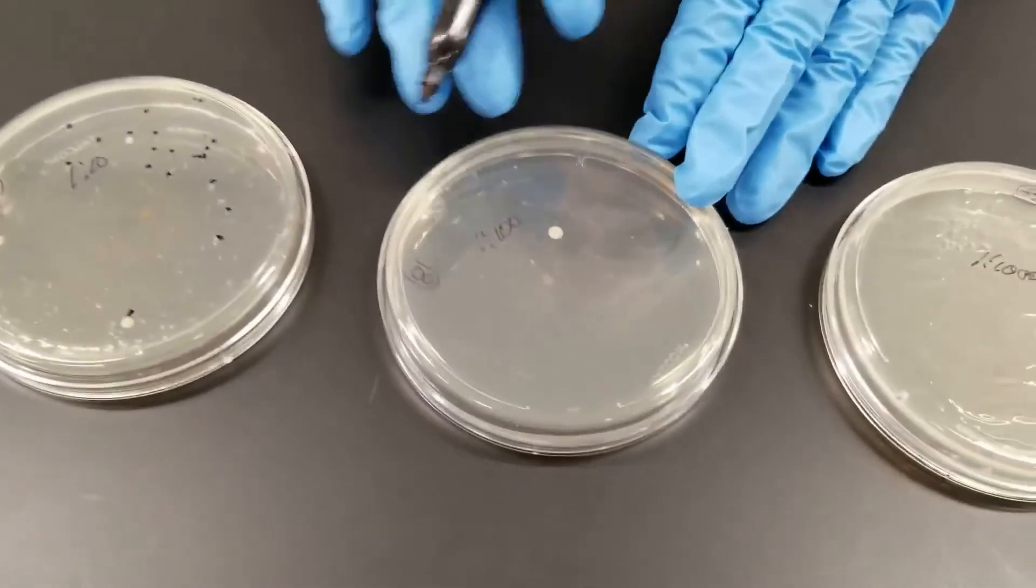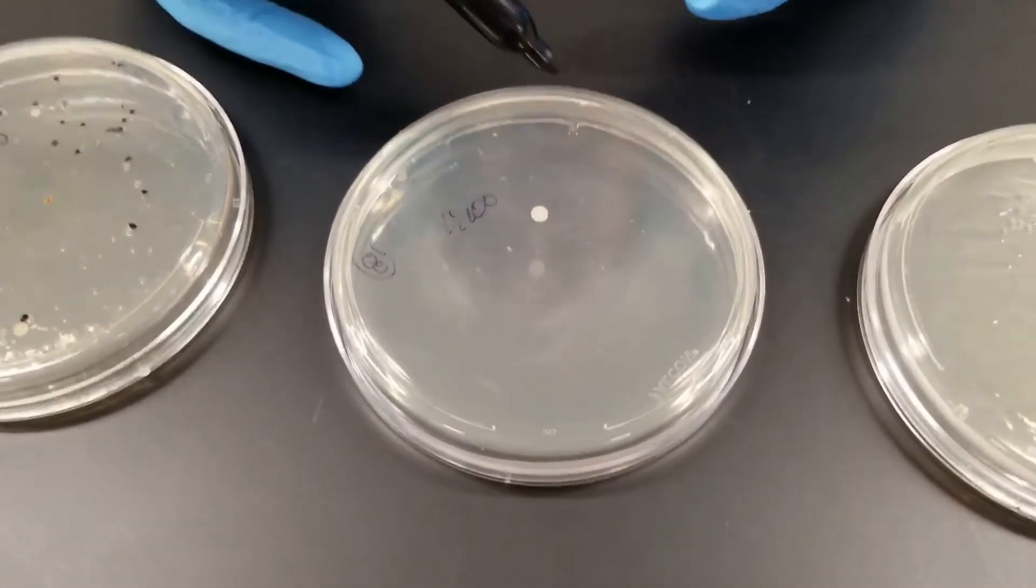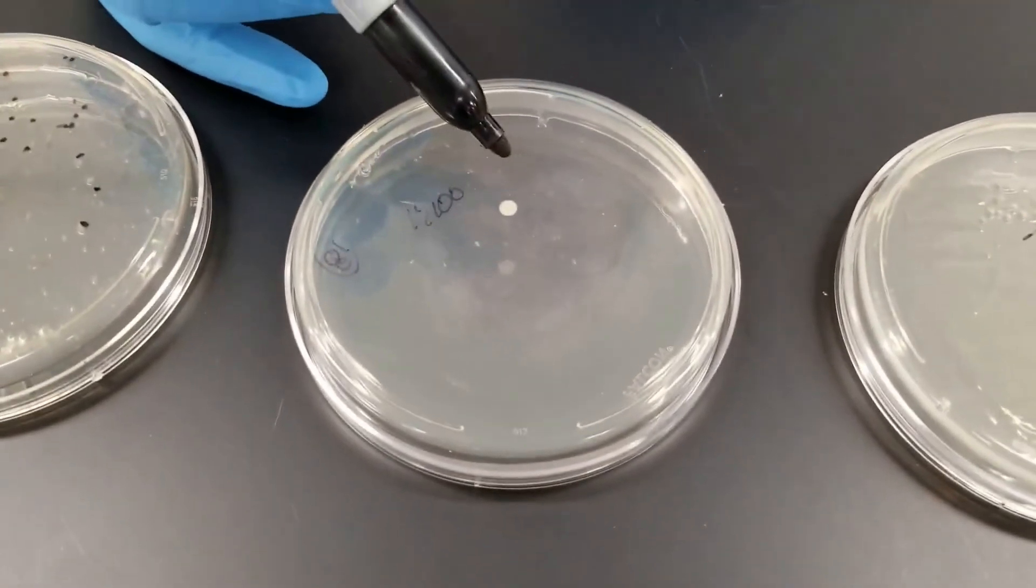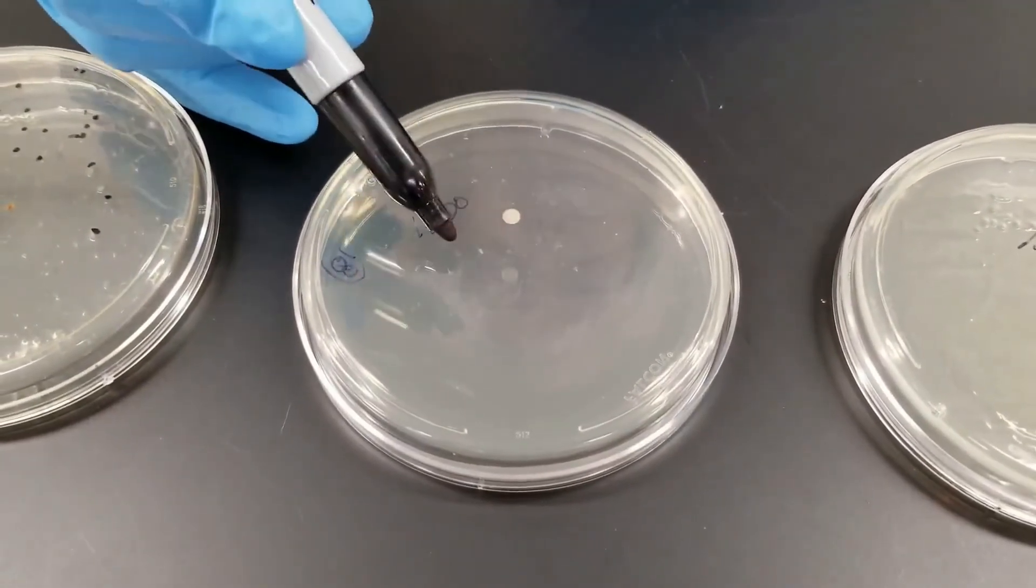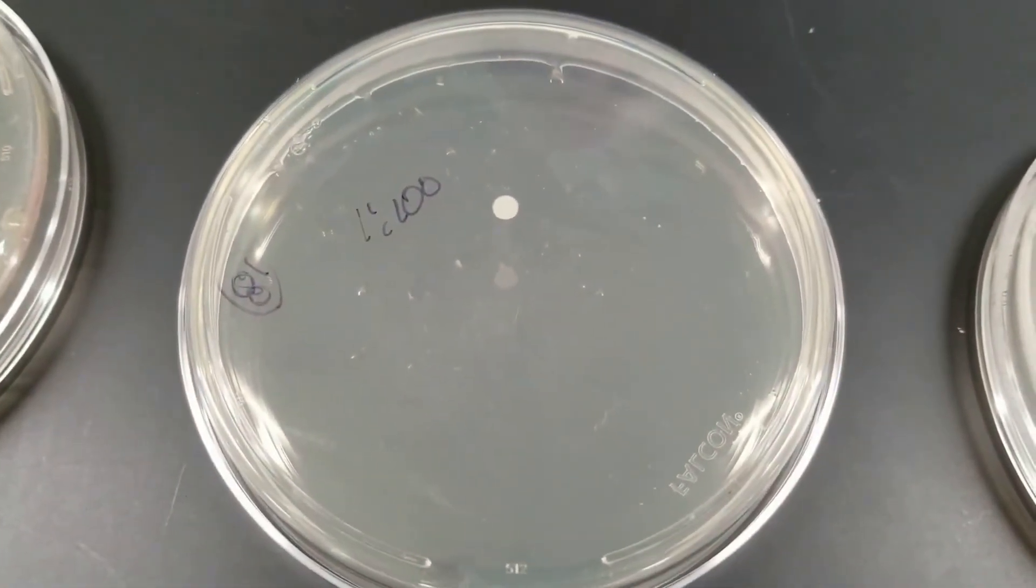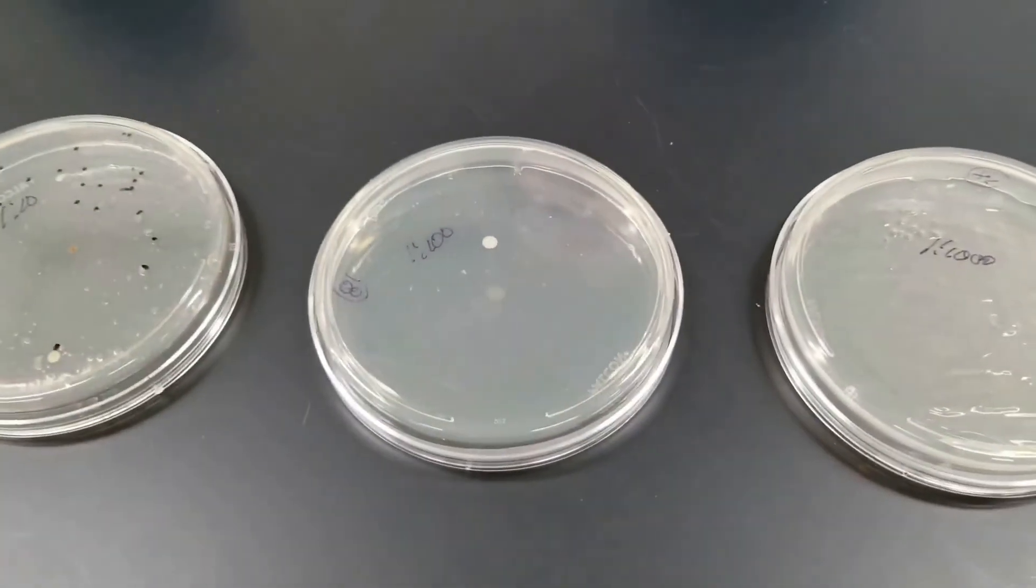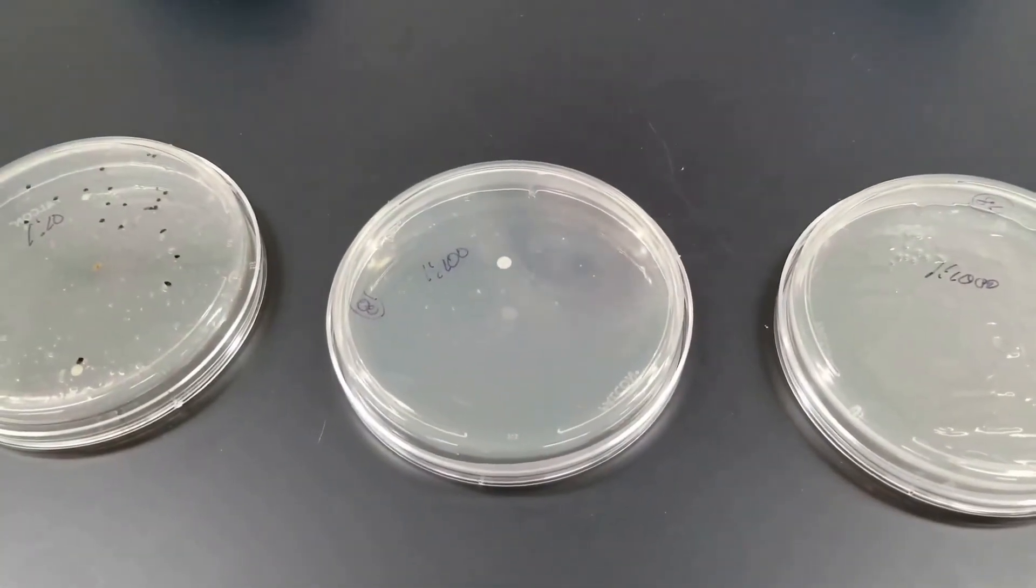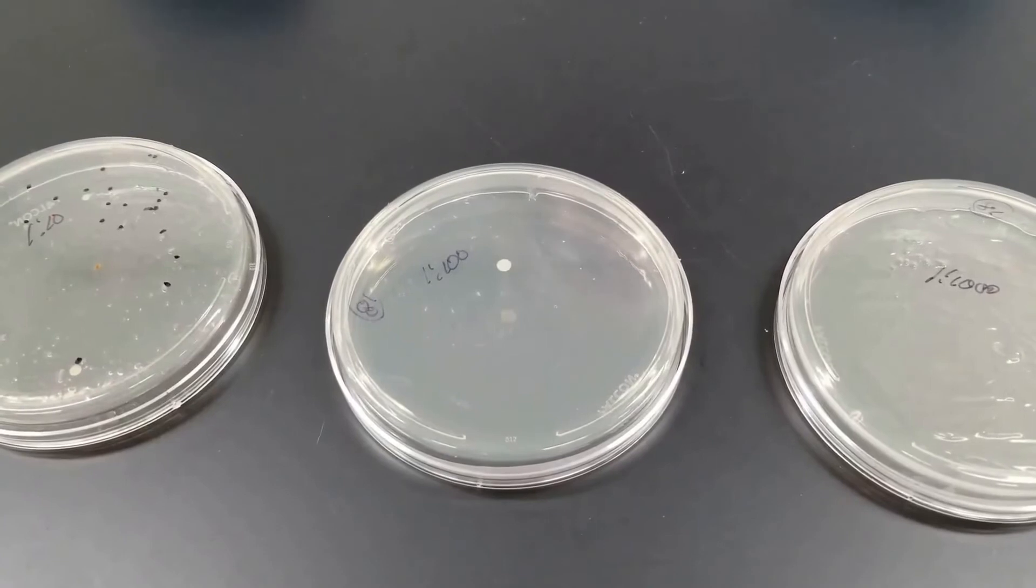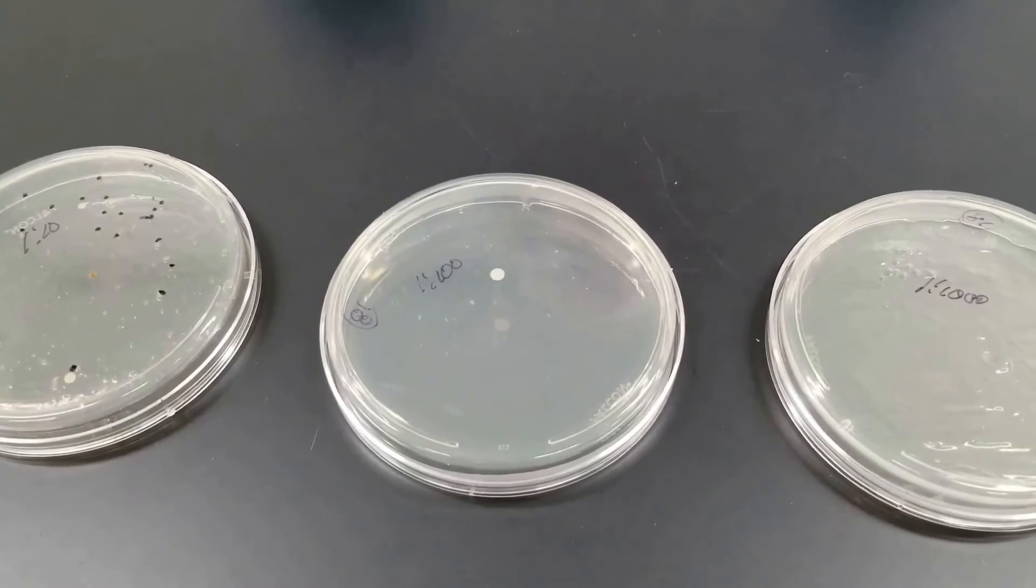Now this plate, the 1 to 100, as you can see there's a large colony right here. And obviously the colonies look different - there's some very small ones scattered in here as well. Well obviously you're going to have different types of bacteria on something like a strawberry or a hamburger or whatever it is that you're testing. If it has bacteria, it's not going to be pure colonies. So once again you're going to count.